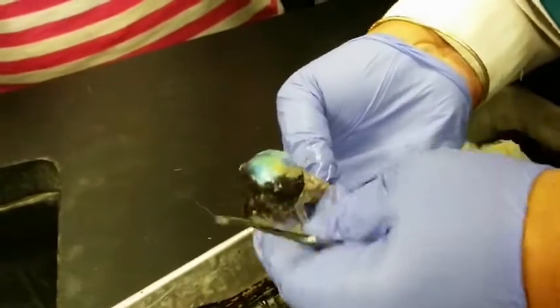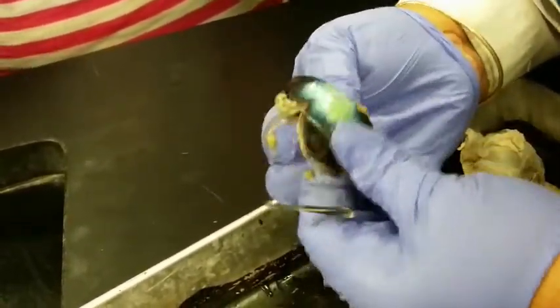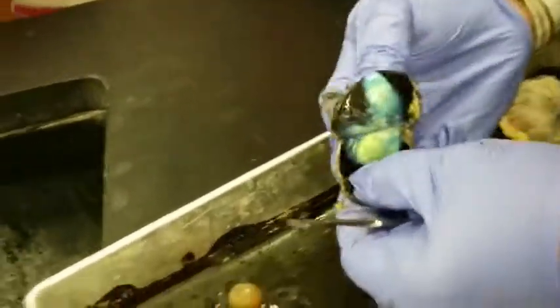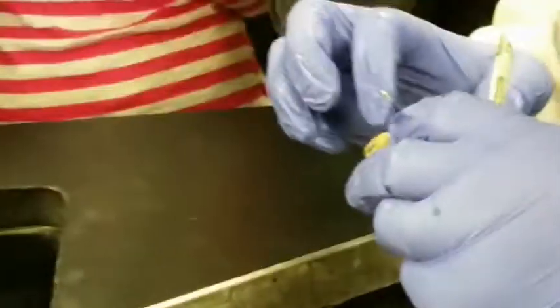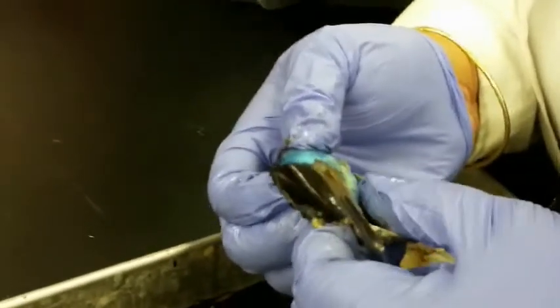Oh boy. It's blue. Is that dyed or is that how it normally is? Yeah, that's how it is normally. Nothing is dyed here. It's the real cow's eye. And now, remember, this is the optic nerve. So that must be the optic disc somewhere.